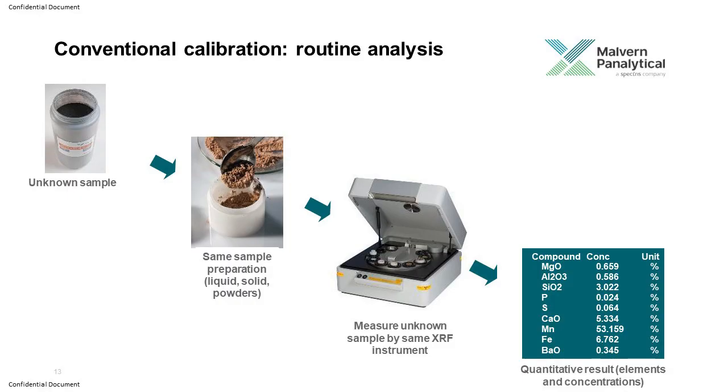Again, you prepare the same way as you had prepared your standards, put into the XRF, and that will give you the elemental composition. So it is a very straightforward kind of technique. And sample preparation, you don't have to digest into acids or those kind of things. You can directly measure just by pressing into a pellet. You can directly measure it onto the XRF.